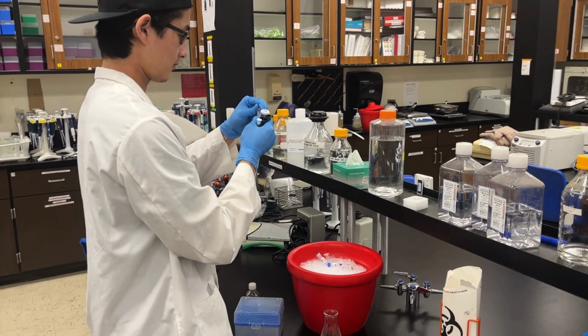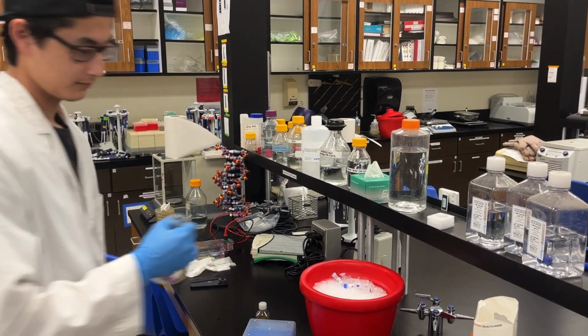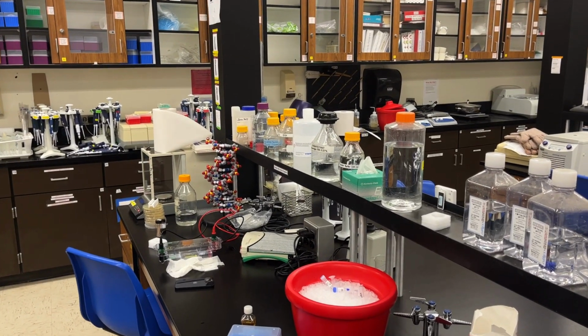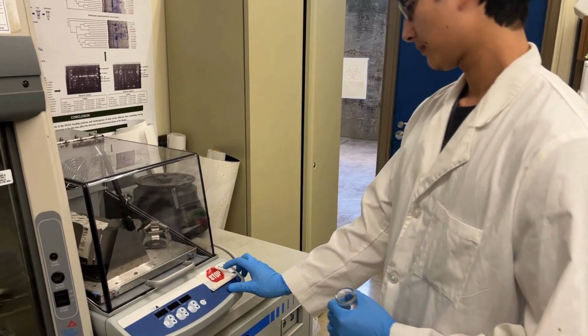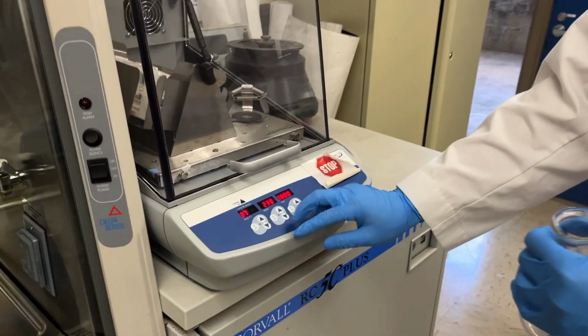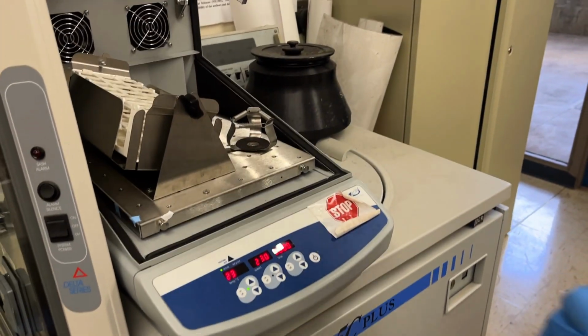And we want to have some aeration or some shaking while it's incubating. So to accomplish this, grab an Erlenmeyer flask and take it to the incubator. Make sure you turn the incubator on. It needs to be set to 37 Celsius. This is a kind of a weird incubator. You actually have to turn the on button and then use the up and down arrows to set the temperature.